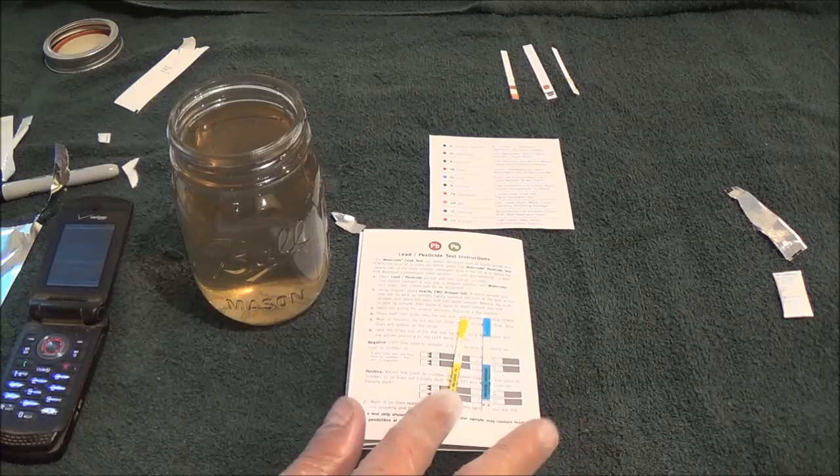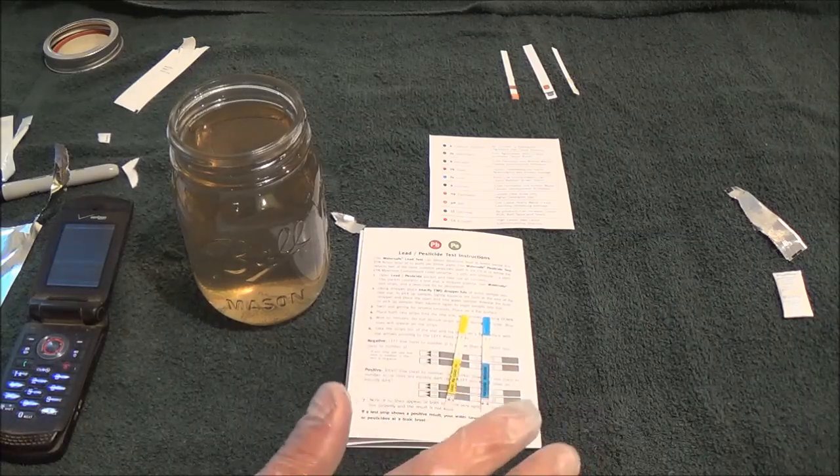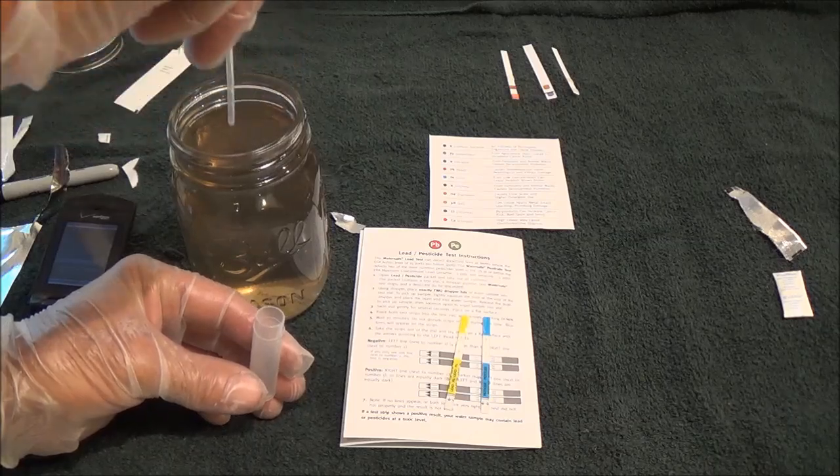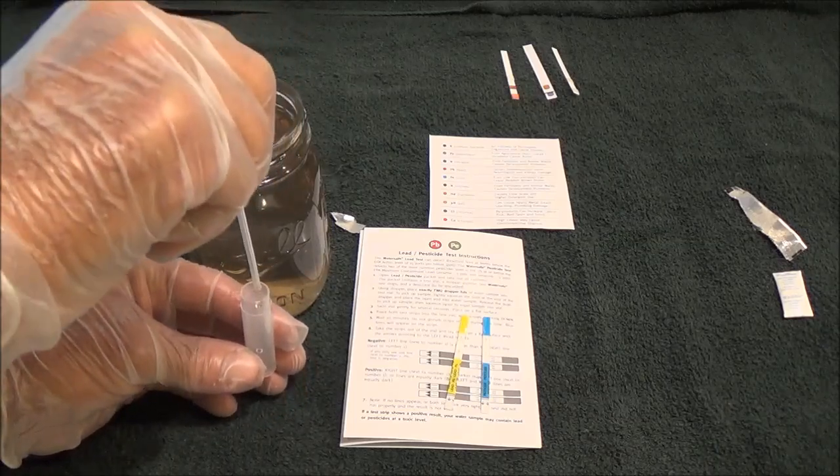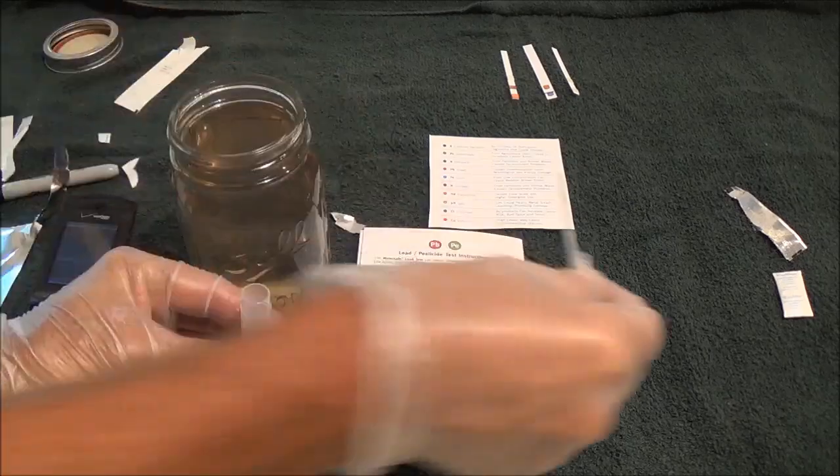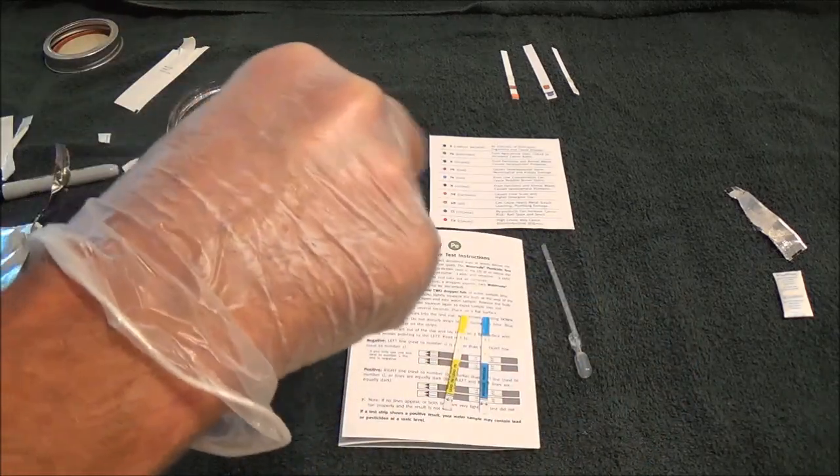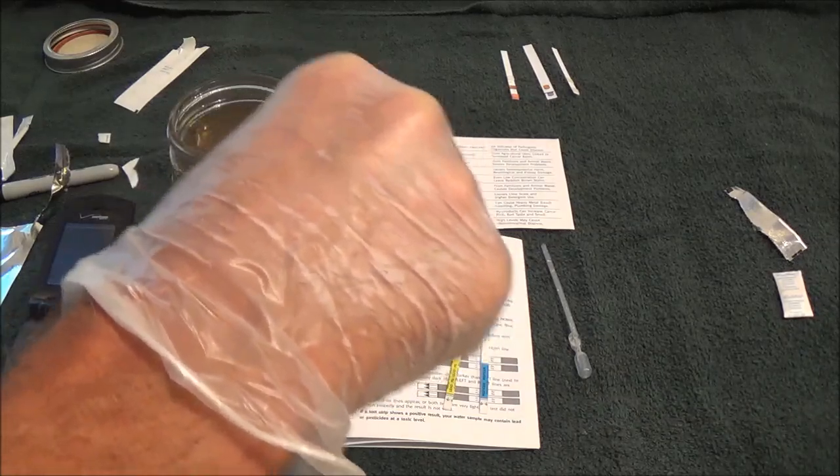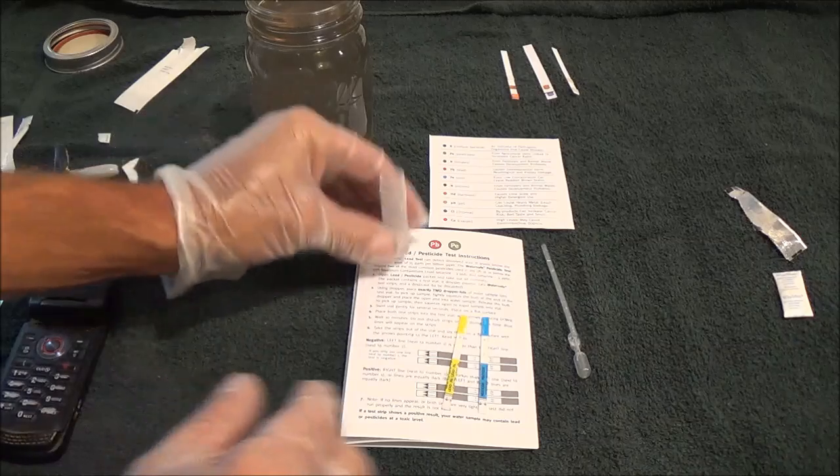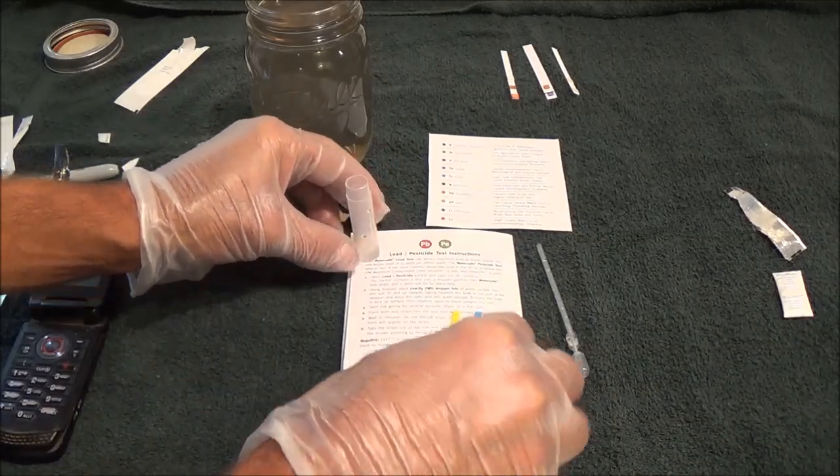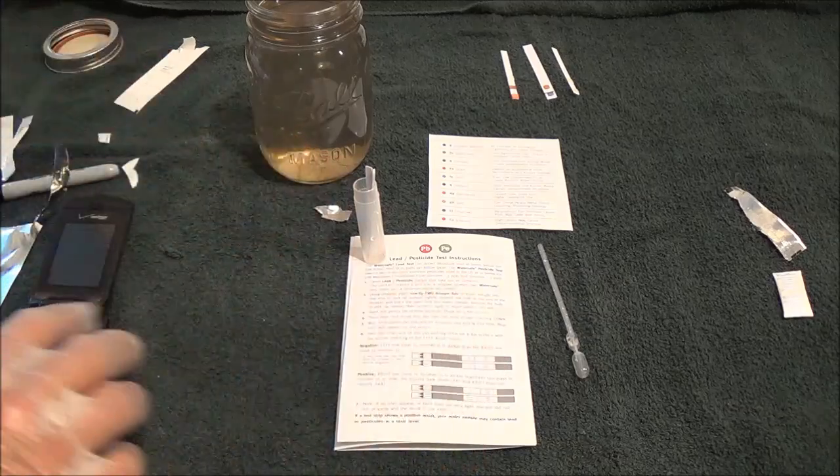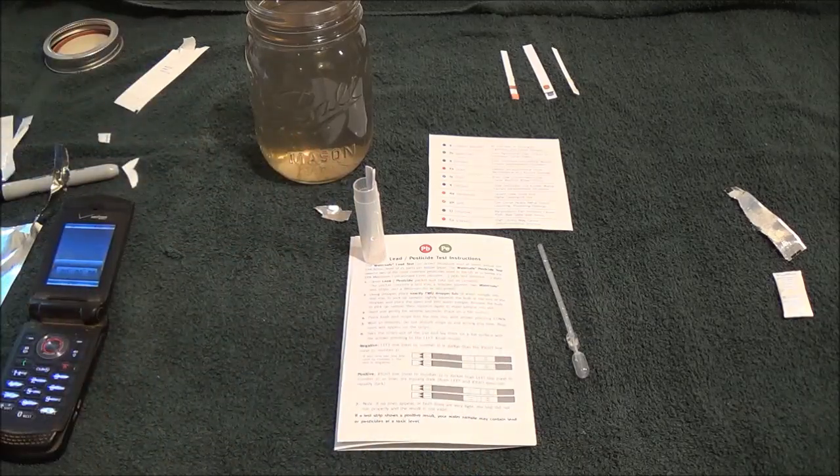Okay, here you can see our two test strips. The yellow one is lead, the blue one is pesticide. This is our little dropper. We're supposed to compress this completely down. There's one, two. Now I'm supposed to swirl this gently for a few seconds. Place this on a flat surface and put the strips in, the arrows pointing down. Alright, we'll start the stopwatch. We'll be back in 10 minutes.